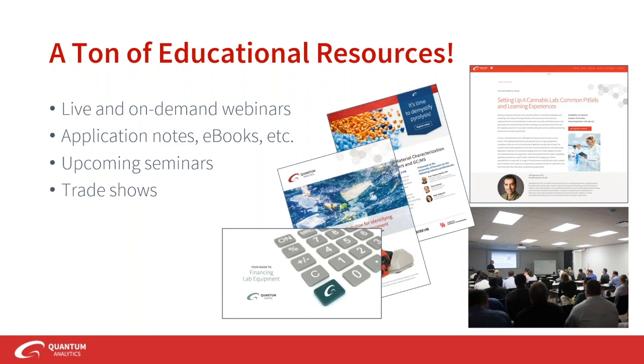The first one is, your talk really only discussed laboratory XRF. Does this information apply to handheld XRF too? Yeah, that's a good question, and I'd say to a degree it does apply. The handheld X-ray systems fall into that energy dispersive category, and it's a great tool to put in the palm of your hand, go out and do some screening of materials, do quick identification of materials.